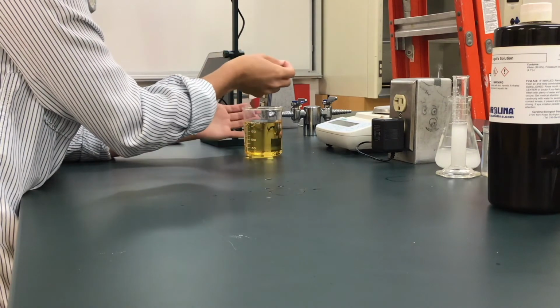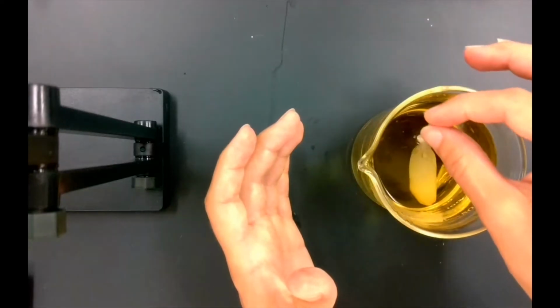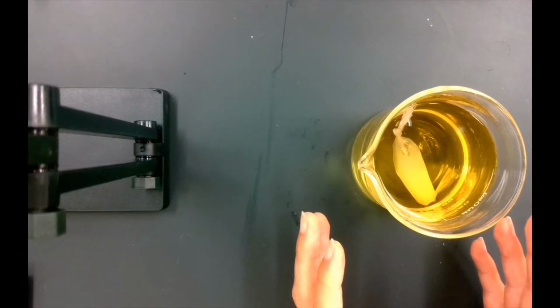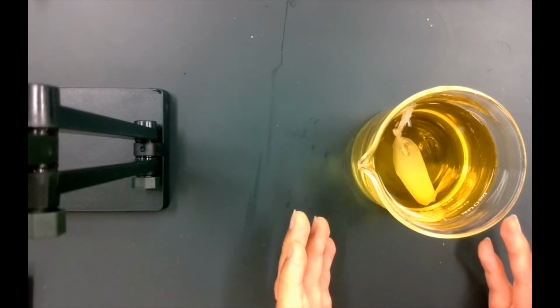But here's what I'm going to do. I'm going to keep my bag, put it into my solution, and then allow this to sit for about an hour. And we'll come back in an hour and we'll be able to see what happens to it over time.